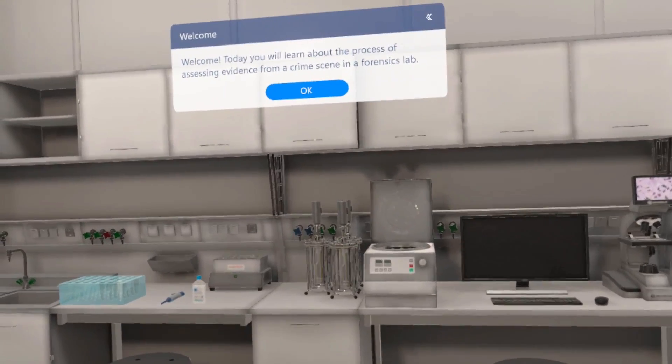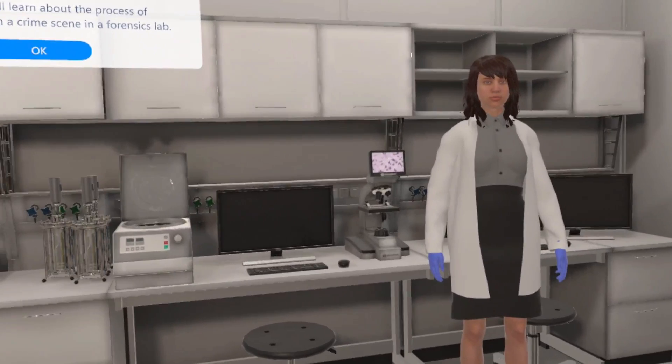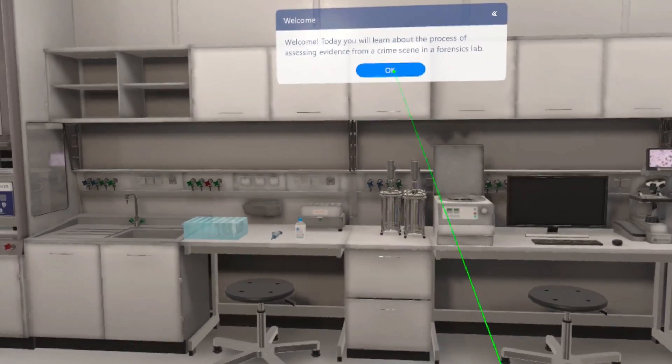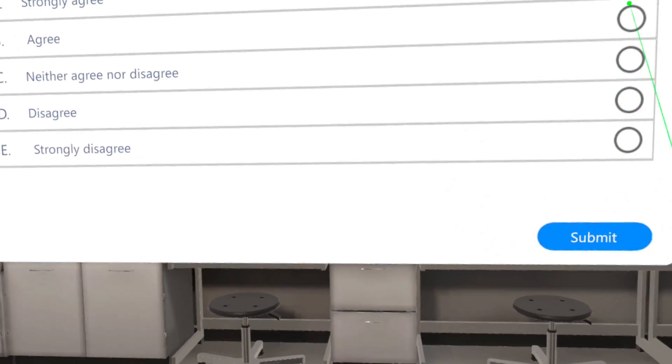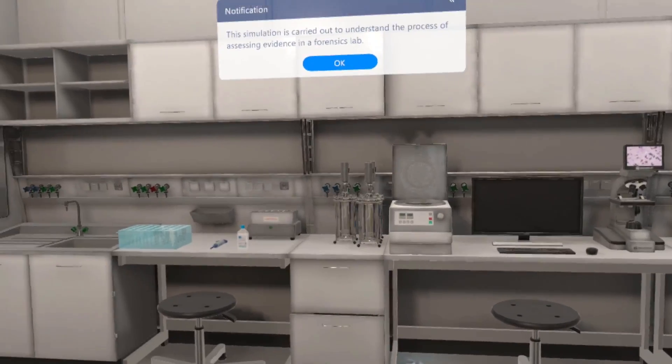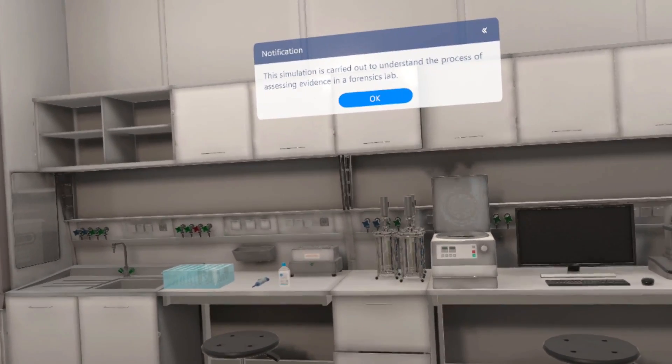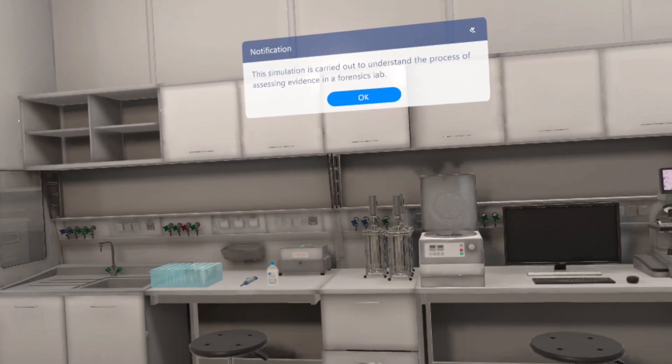Welcome! Today you will learn about the process of assessing evidence from a crime scene in a forensics lab. This simulation is carried out to understand the process of assessing evidence in a forensics lab.